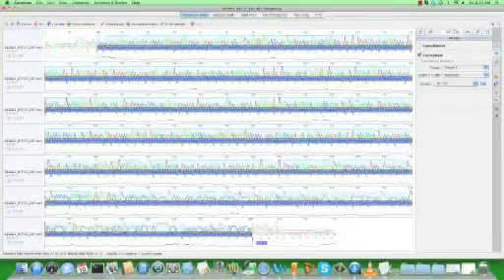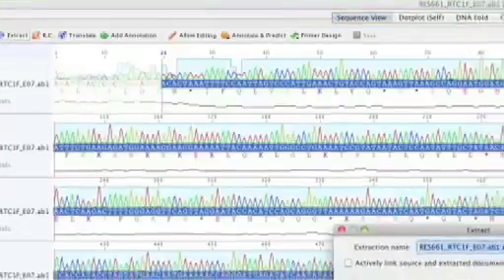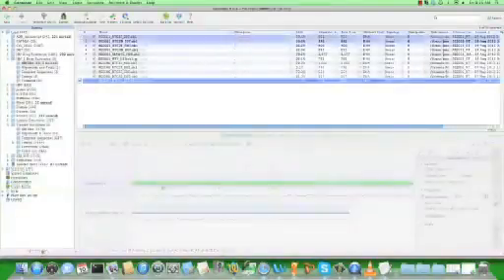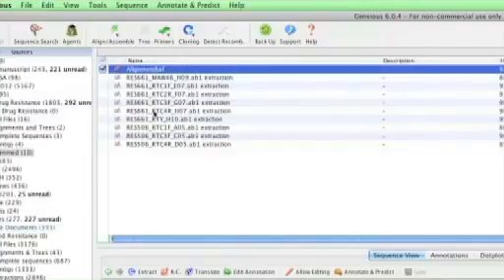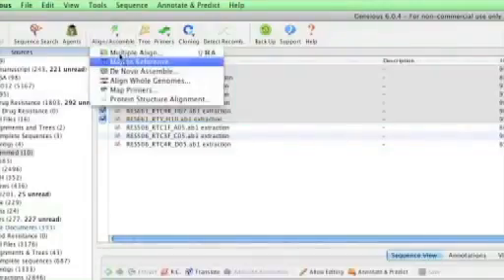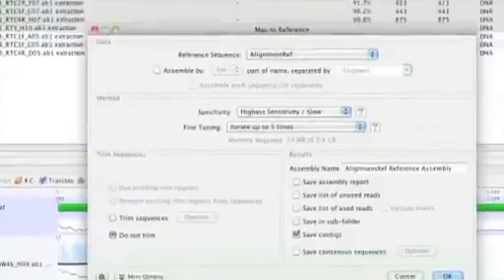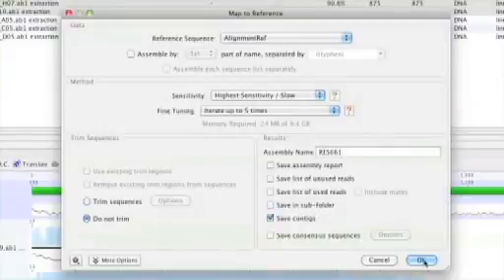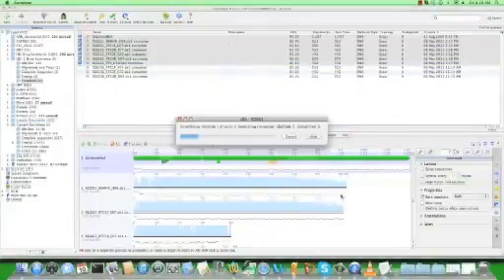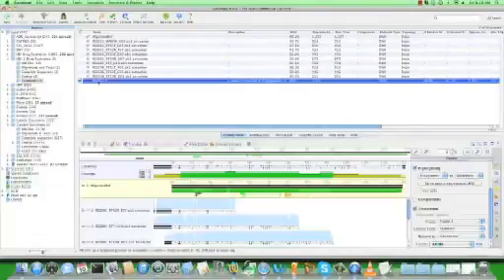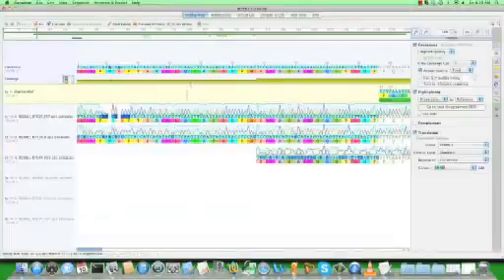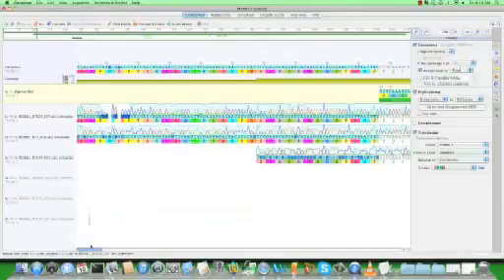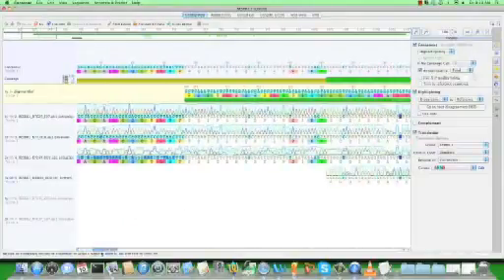Using your cursor, select the midsection of the sequence, leaving out the ends. Click on the extract button to extract the region with high quality sequence. Select all four extracted sequences for each sample and assemble them against an annotated reference sequence. Inspect the assembled sequence to ensure that you are in the correct reading frame. If you are in the correct reading frame, the beginning of subtype C protease should start with the following amino acids: P-Q-I-L-W-T.